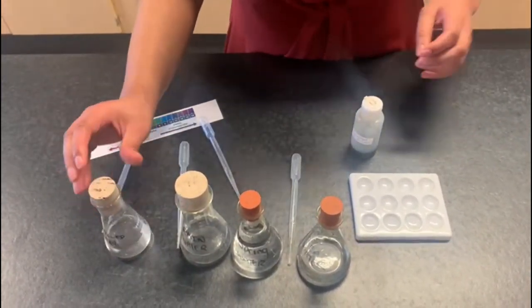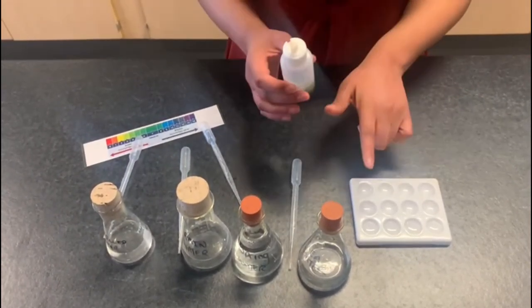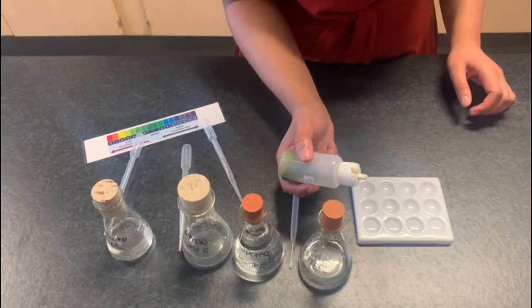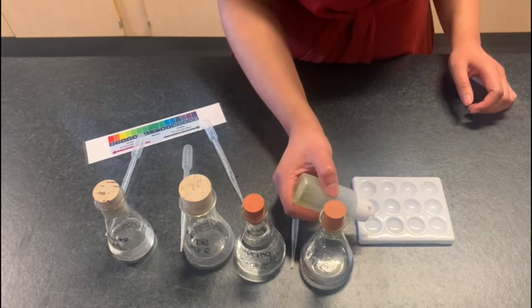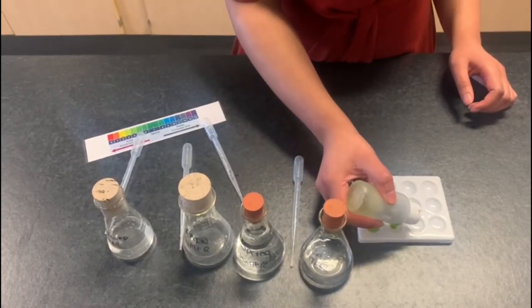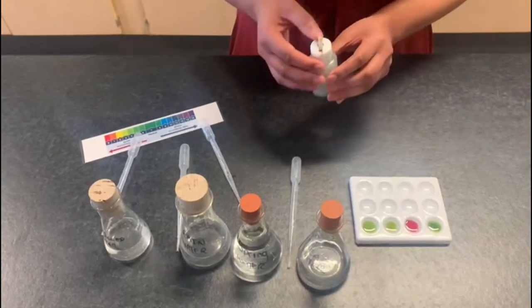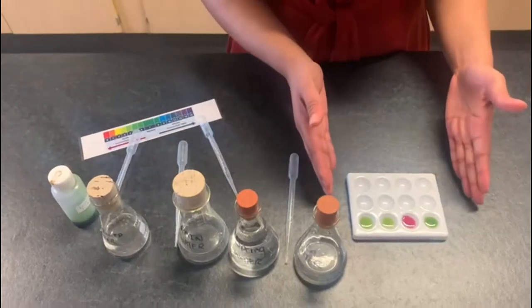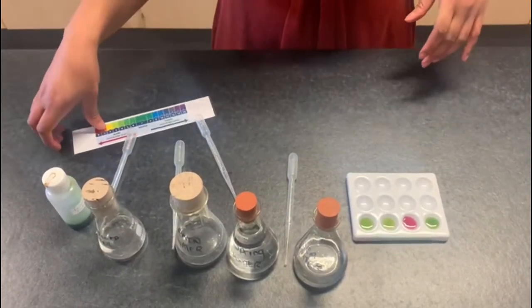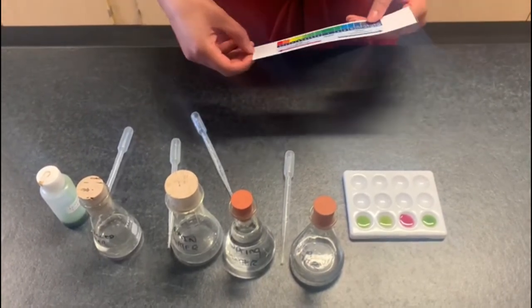We are now going to test the pH of each of these samples using universal indicator. So to the samples that we've put into the spotting tile I will drop a drop of the universal indicator. We can see a color change straight away. For the results all you need to do is check them against the pH scale.